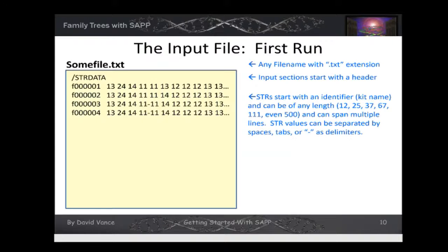So if I just create one section in my input file, this is all I need really for STR data. I do /STR data. I can call the file anything I like.